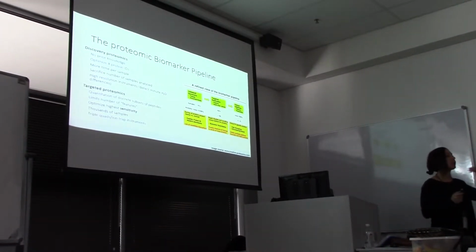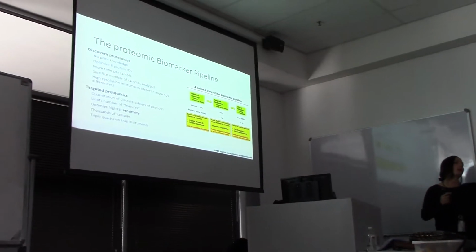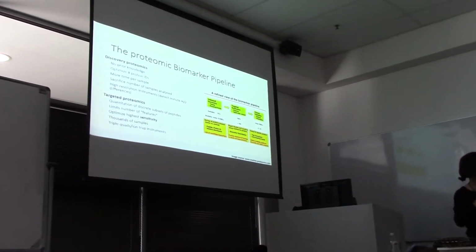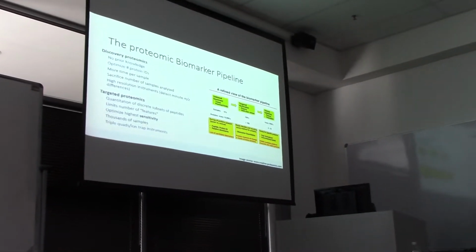So just to recap the proteomic pipeline we've been talking about, you're really starting with lots of molecules and really narrowing down into a few candidates that are exciting.